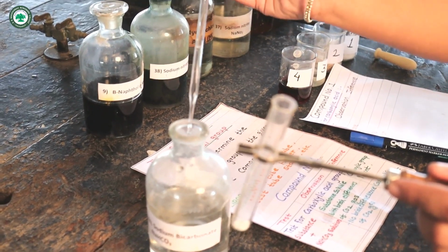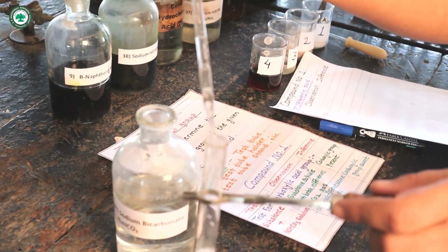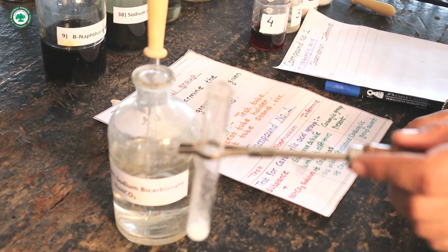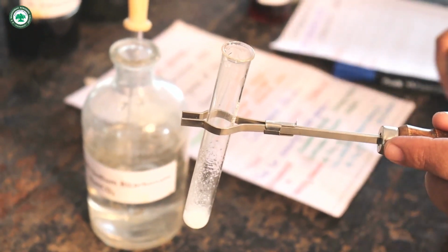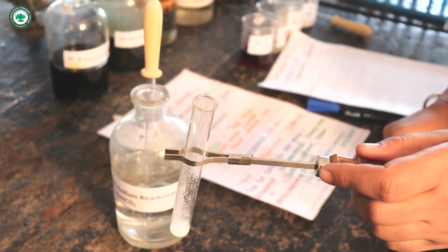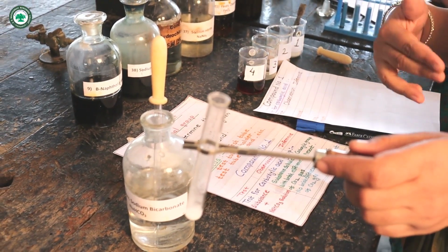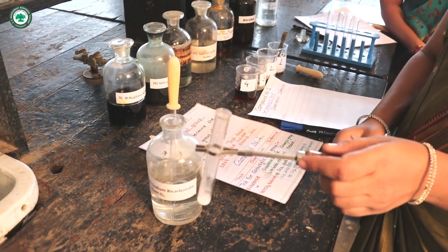Observe carefully. Brisk effervescence of CO2 is observed. Therefore, the functional group of this organic compound is carboxylic acid. There is no necessity to take a next test for this compound. Then write the result of this compound.